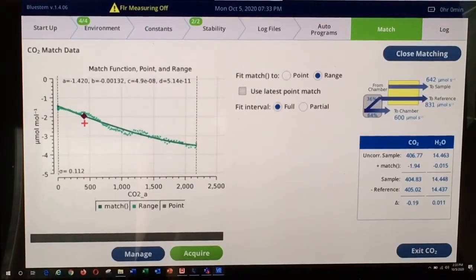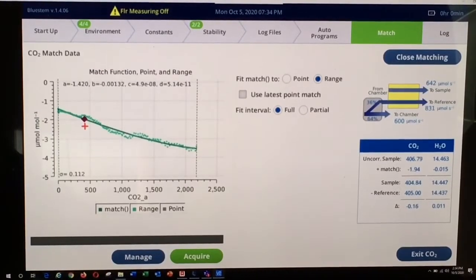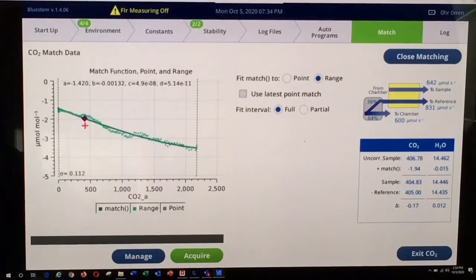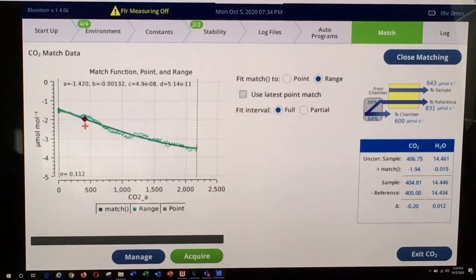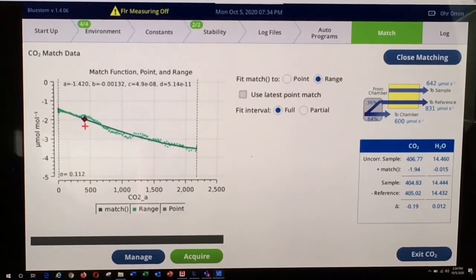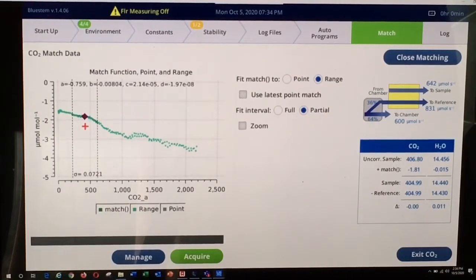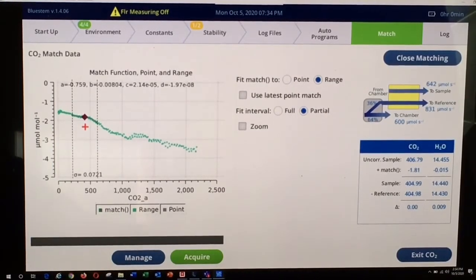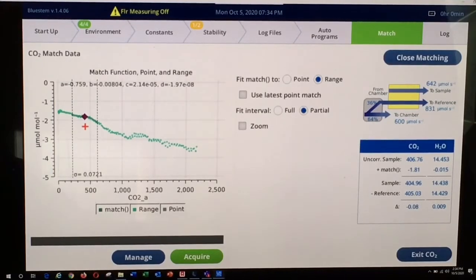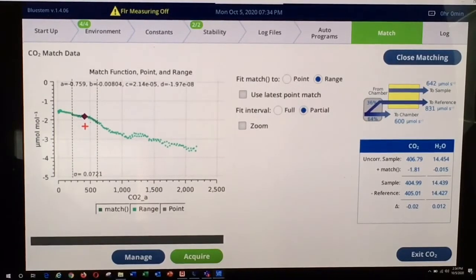After you exit the range match screen and the curve is completed, you can select various fitting options. A complete curve fit using a polynomial to fit all of the available data is one option. Another is the partial fit option, which allows just a partial fit to be completed to the range match data. This is particularly useful if you're operating in a very limited CO2 concentration range, as I'm doing here today. I'm going to select the partial fit — you can see that the highlighted portion of the curve is just a fraction of all the available data, and the instrument has fit just that small portion.